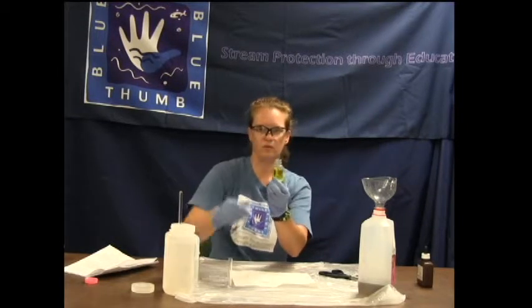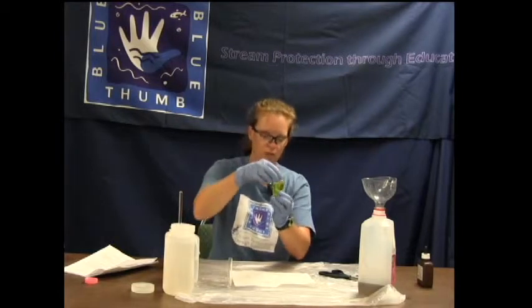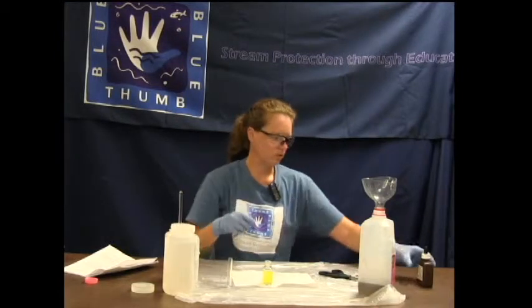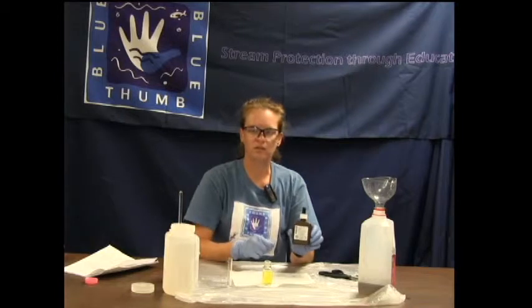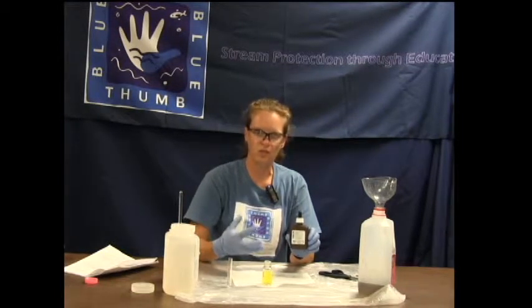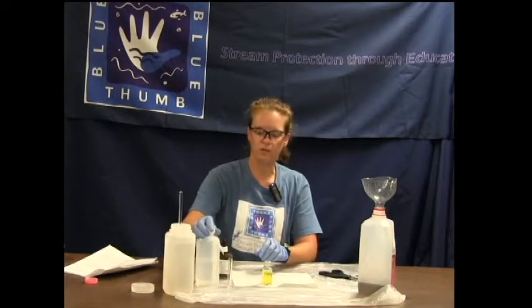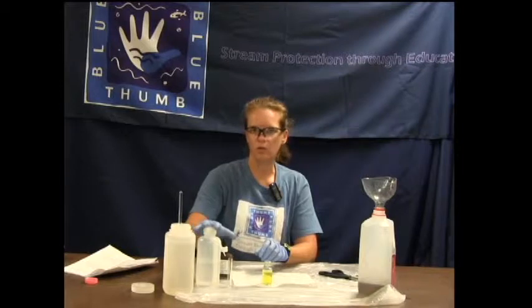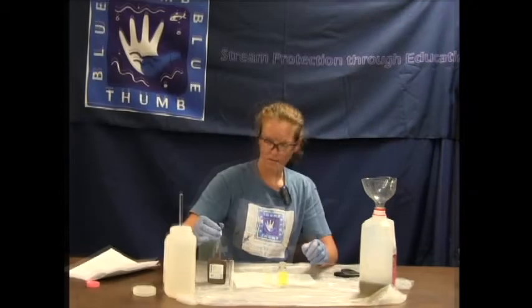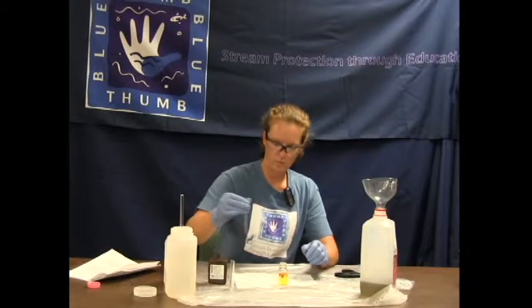Chloride should always start out as yellow, whether you are running your creek water or the blank — it should always start out as yellow. Then you are going to titrate with the silver nitrate, which is just adding a drop and swirling until you get a distinct color change that stays. This is the blank with deionized water, so there should not be any chlorides in this water, and it should change at the first drop.